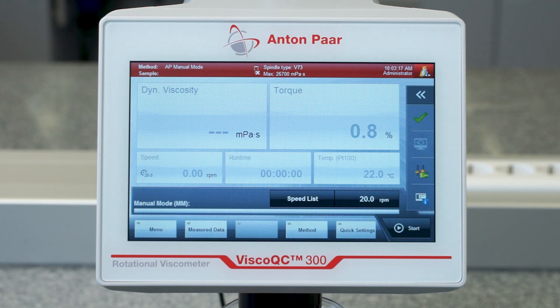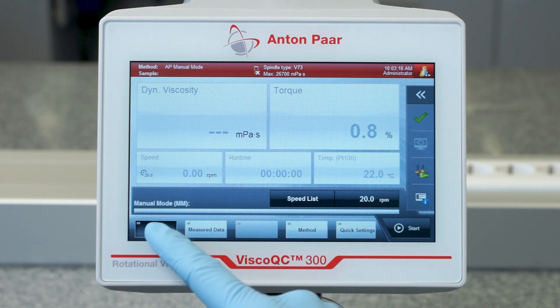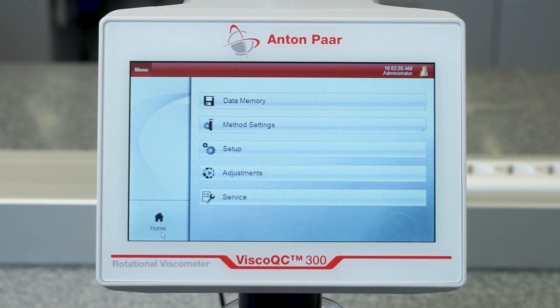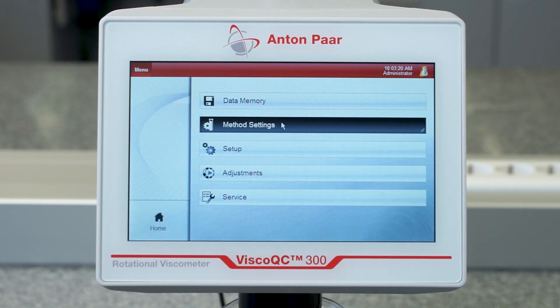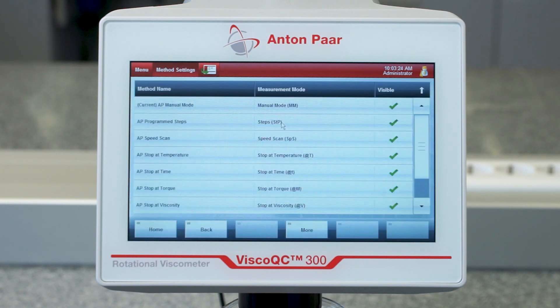You can easily customize your own method by copying a default method such as APYieldPoint.